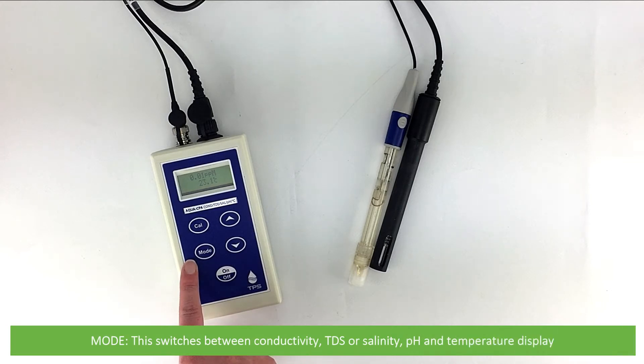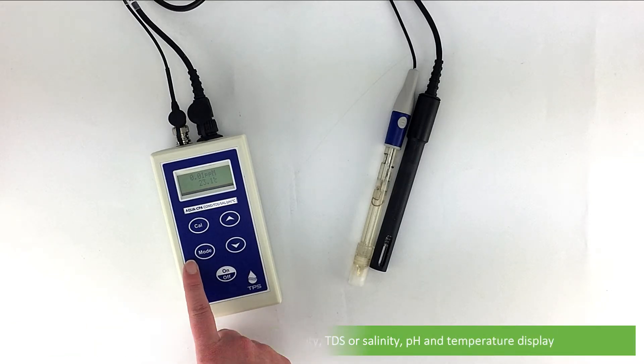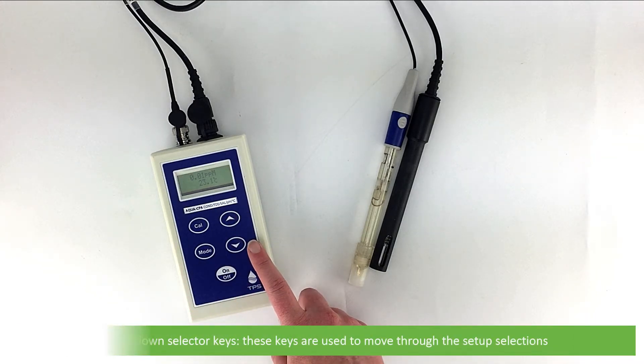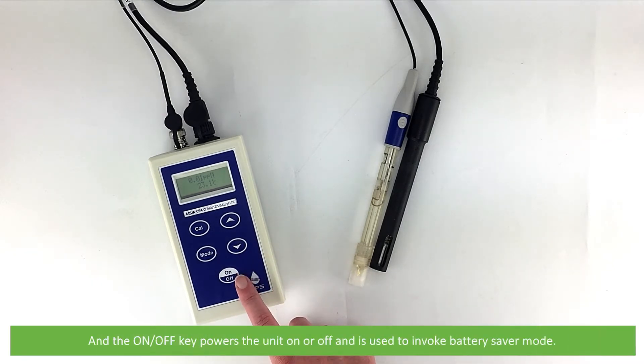Mode switches between conductivity, TDS, salinity, pH and temperature display. Up and down selector keys are used to move through the setup selections, and the on-off key powers the unit on or off and is used to invoke battery saver mode.